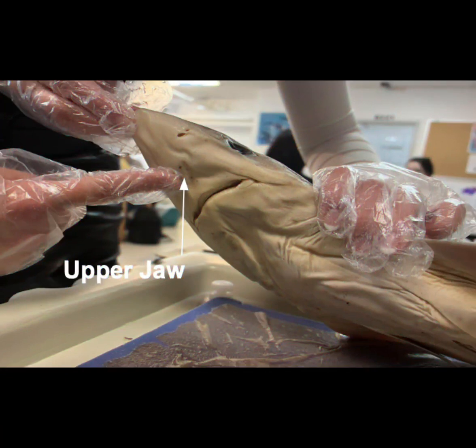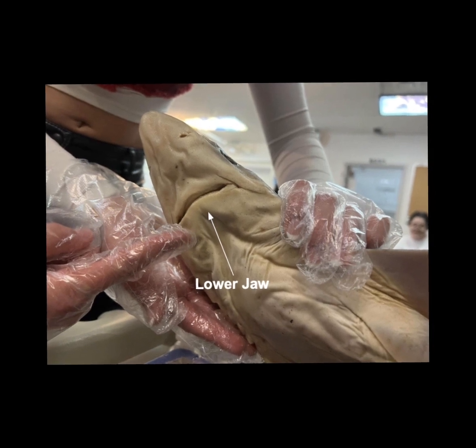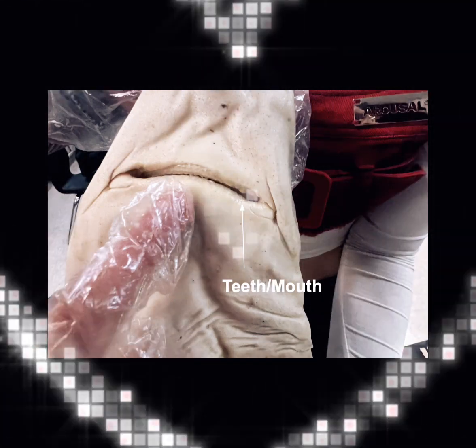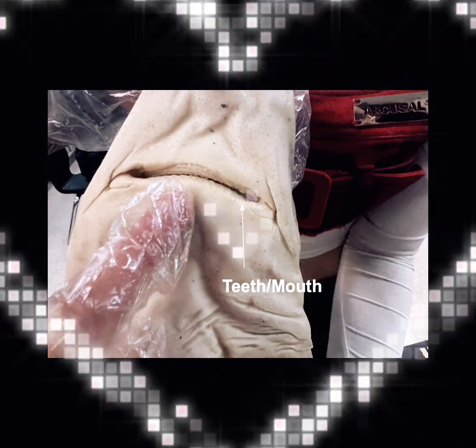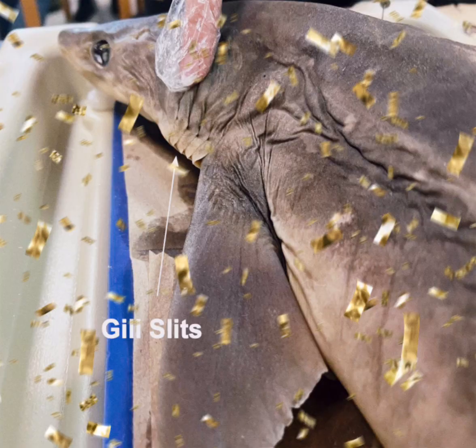Jaws are made of flexible cartilage that are capable of detaching from the skull, and powerful muscles are attached to the jaw that allow them to exert high biting force. The mouth is located on the underside, or the ventral side, of the shark. The teeth are sharp and pointy, and there are several rows of these teeth, as they fall out frequently. These are used for catching and eating prey.